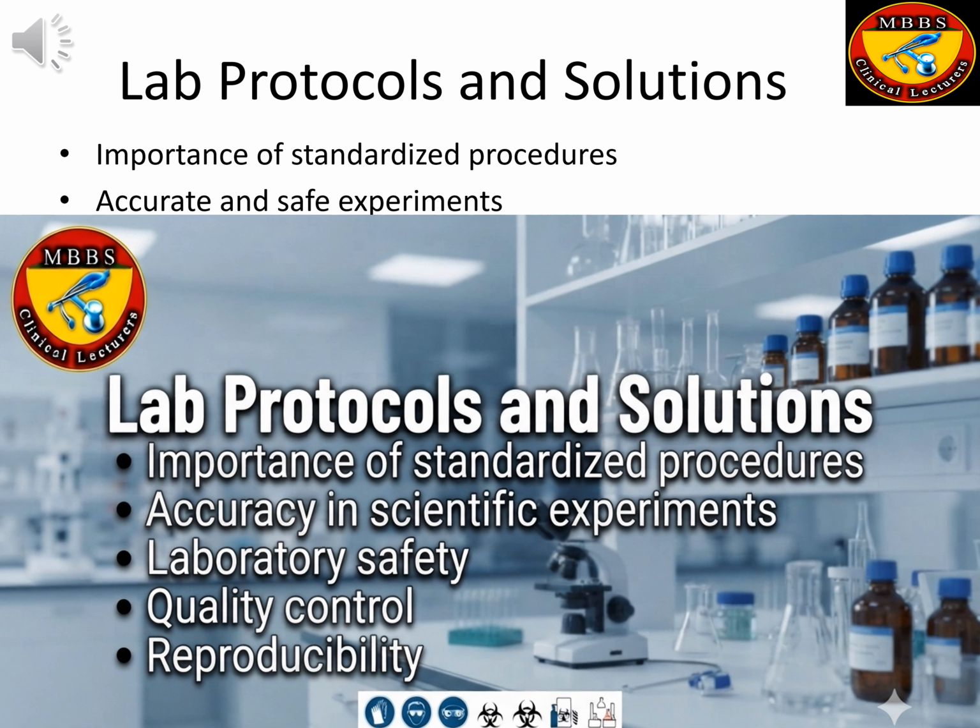A laboratory protocol is a written set of standardized instructions that guide scientists through every step of an experiment. These protocols ensure that all procedures are performed consistently regardless of who performs them. Standardization reduces errors, improves reproducibility, and enhances laboratory safety. Protocols are particularly important because many laboratory experiments involve hazardous chemicals, infectious microorganisms, or expensive instruments. Even a small mistake can lead to inaccurate results, contamination, equipment damage, or accidents.